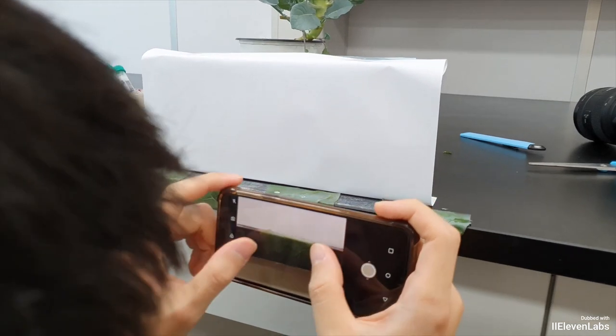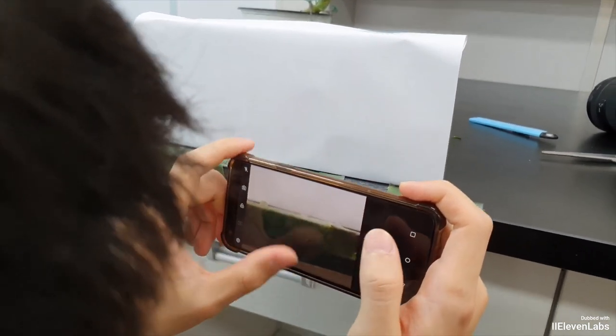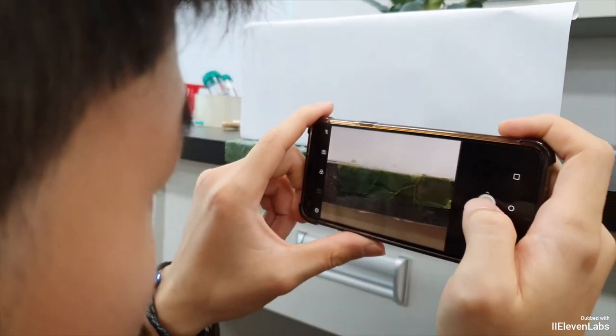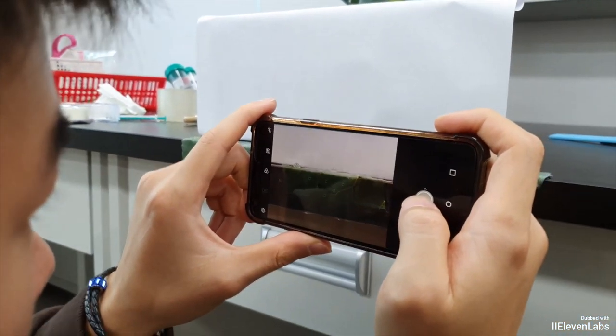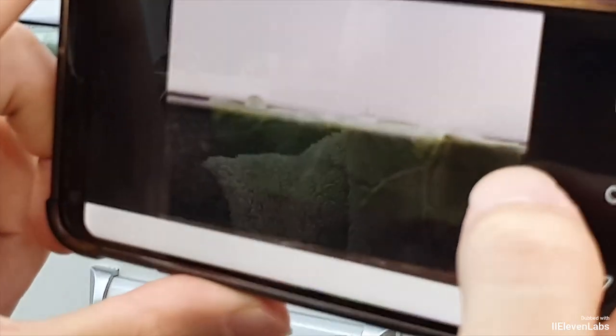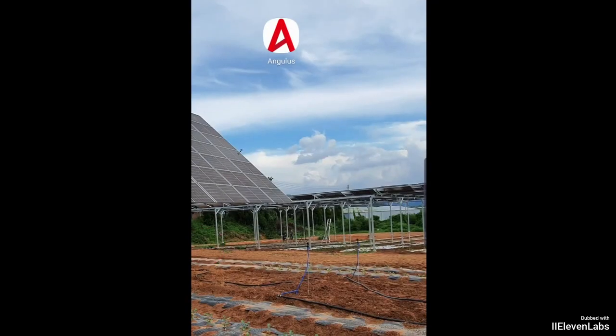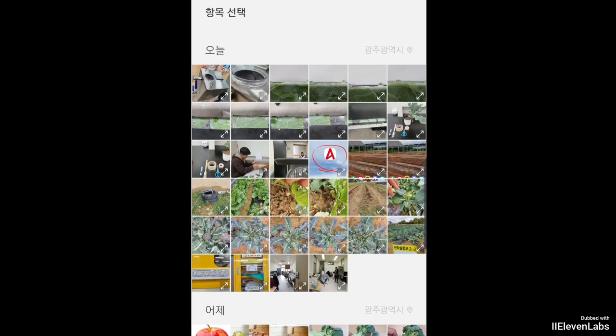Understanding the role of surfactants, the same method can compare contact angles with and without wax to study plant surface wettability. Students can use the zoom feature on their smartphones to capture the droplet horizontally. Afterward, open the photo for analysis.